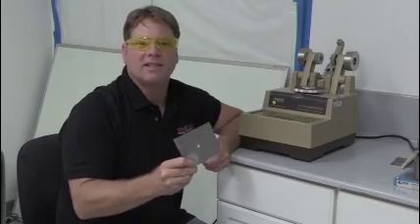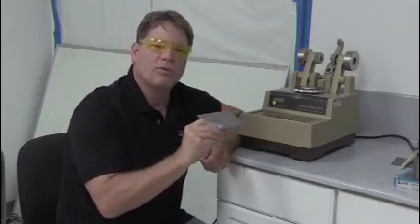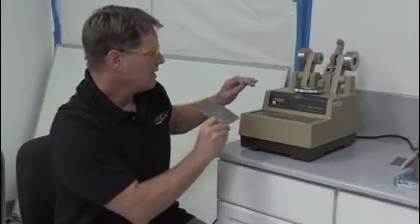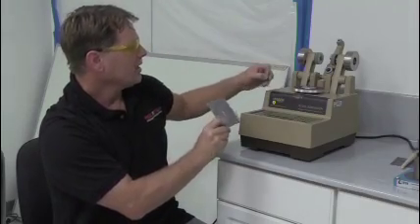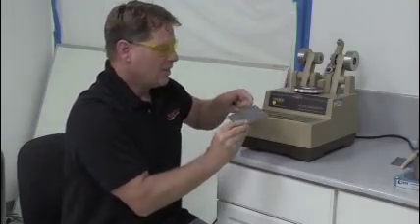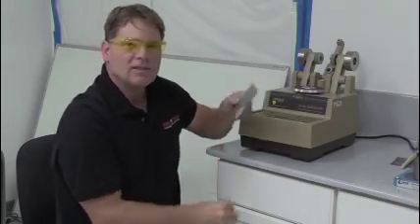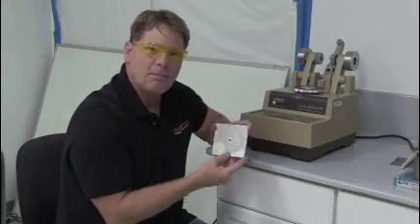ASTM D4060 measures abrasion based on Tabor wheel abrader. So this is a machine that measures weight loss from a coated metal panel.